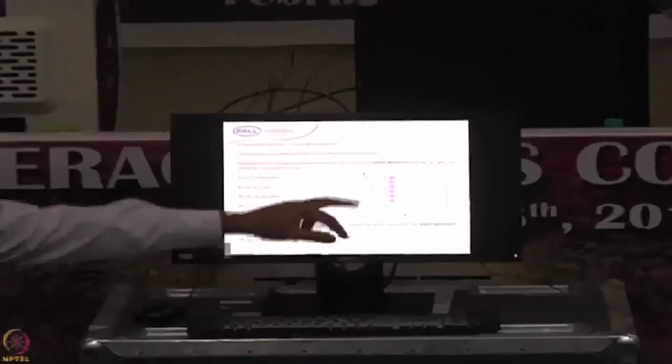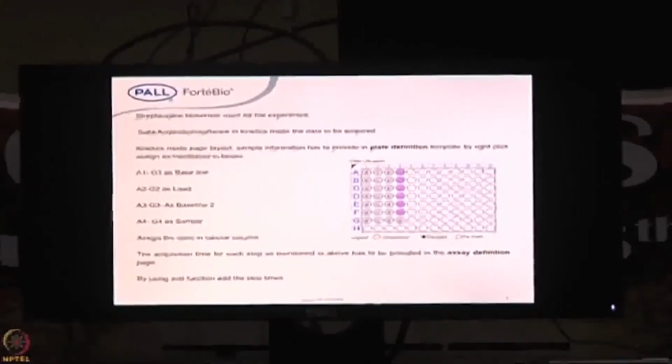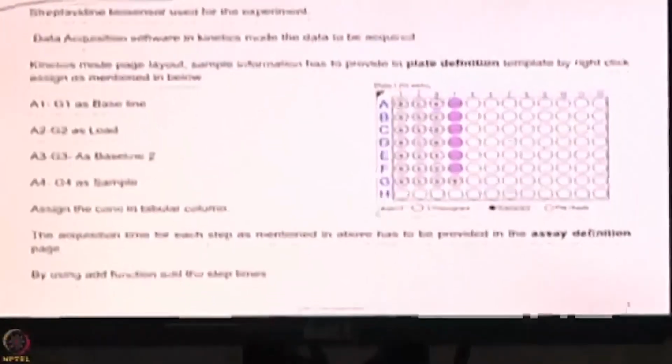Now the concentrations we can look at before that. The biotinylated protein A ligand, I will take around 1.2 microgram per ml. That much concentration is good enough for the immobilization of the biotinylated ligand protein A. And the mouse monoclonal antibody, I will take around 10 microgram per ml, which is equal to around 66.6 nanomolar. Using 66.6 nanomolar as the highest concentration, we will go with threefold dilutions. Around 6 titration points we can do using that.